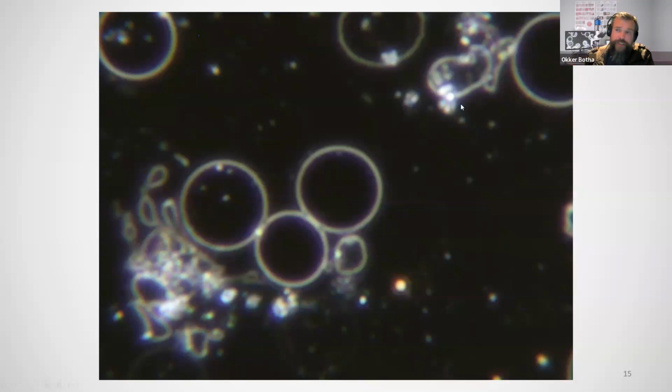So there are some structures, some pleomorphic growth forms and some other structures and anomalies that we usually only see in dark field, but when they're quite severe and quite advanced, they then become visible in bright field and in some of the inferior dark field systems.